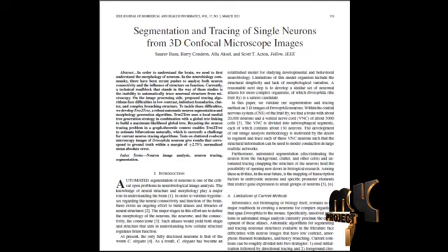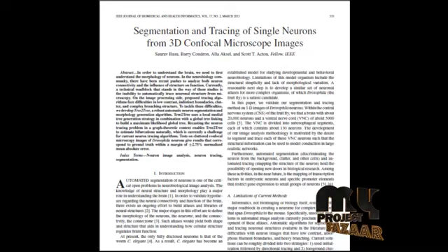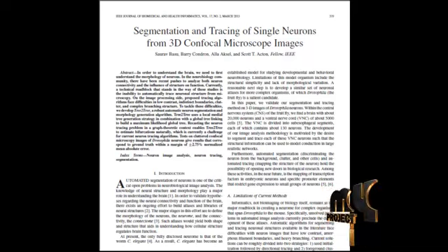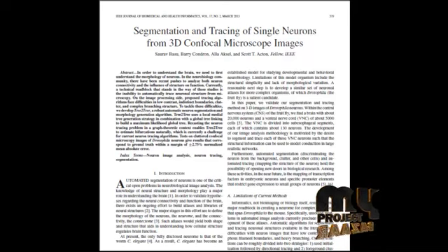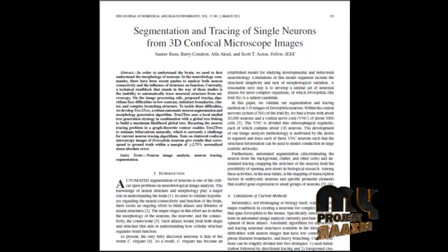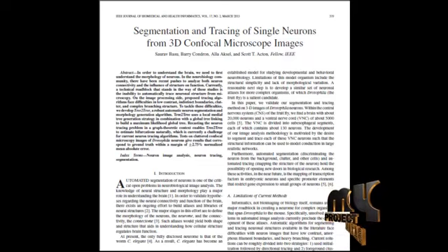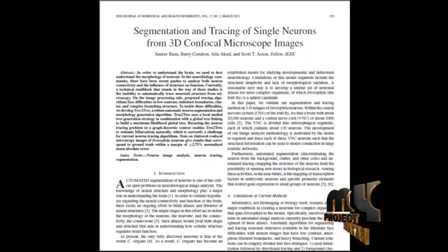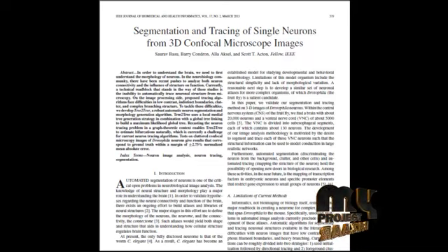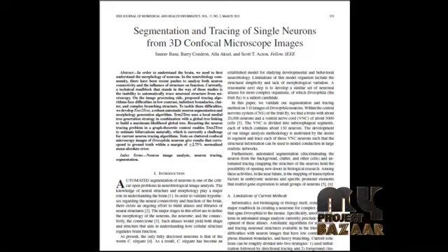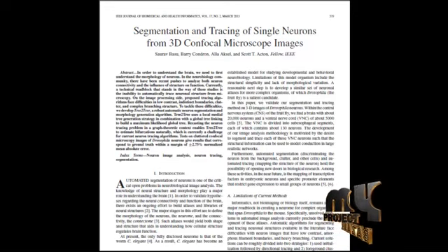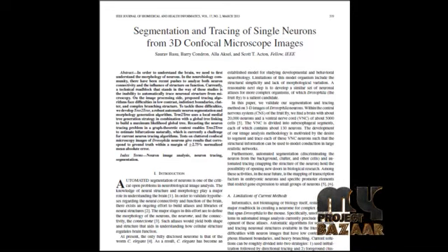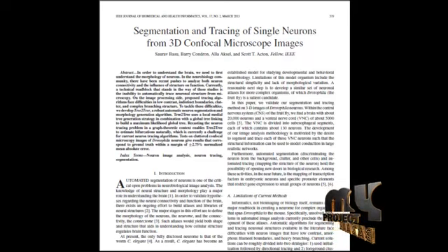Here we propose a method of segmenting and tracing single neurons. We developed Tree2Tree, a robust automatic neuron segmentation and morphology generation algorithm. Tree2Tree uses a local medial tree generation strategy in combination with global tree linking to build a maximum likelihood global tree. The single neuron image will be the input of the process.